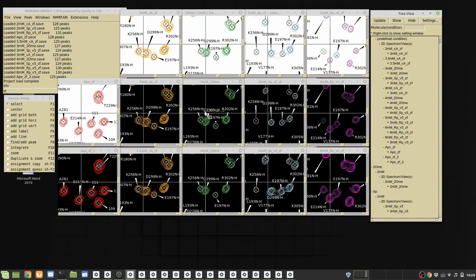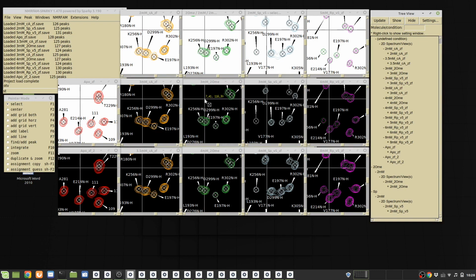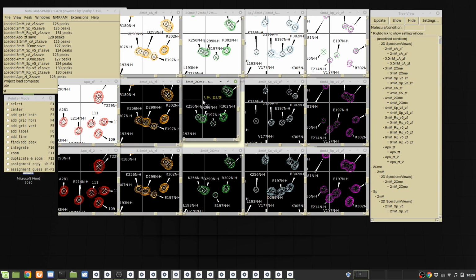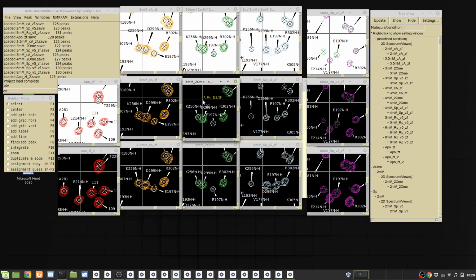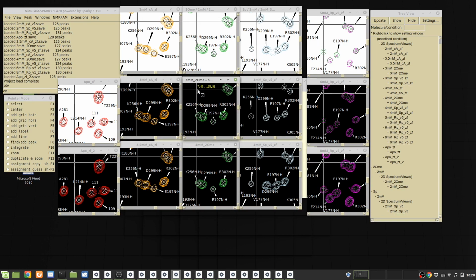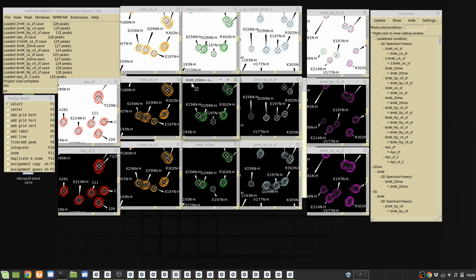And you might be wondering how I manage these view sizes. There is a new tool implemented called Organize Neighbors. You can just type ON, and then you can see that neighboring experiments will be resized using the one that you are selecting, and then will snap to the experiment that you have.